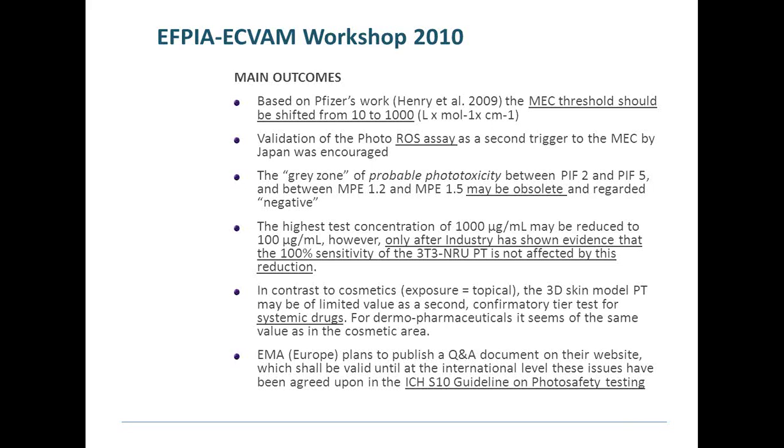These are the main outcomes of the ECVAM workshop based on the work of Pfizer, the Henry et al. publication that I just showed. The MEC was shifted from 10 to 1,000.